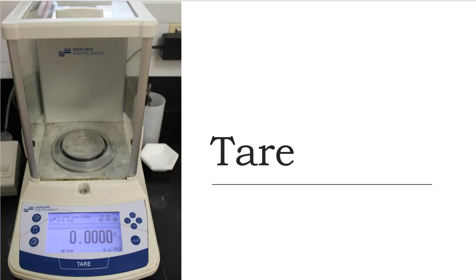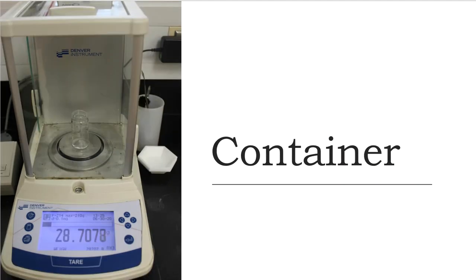Now I'm going to go to my balance and tare it. I get 0.0000, that's pretty good. Then I put a container on there, because I'm getting ready to make the iodine THF solution, so I need to know how much iodine I'm going to be weighing out. I'm going to make it in this small vial. 28.7078 is the mass of the vial.